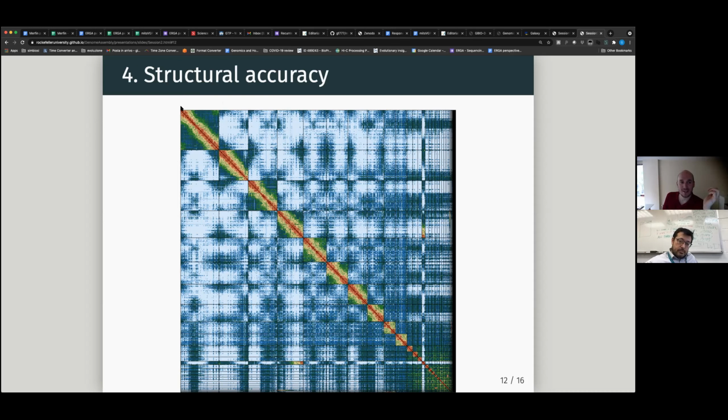So basically, this box here corresponds to chromosome 1 against itself. You would expect to see that the mapping is within the same chromosome if you actually reconstructed the chromosome correctly. And you shouldn't see reads that map between chromosomes if the chromosomes are correctly reconstructed.